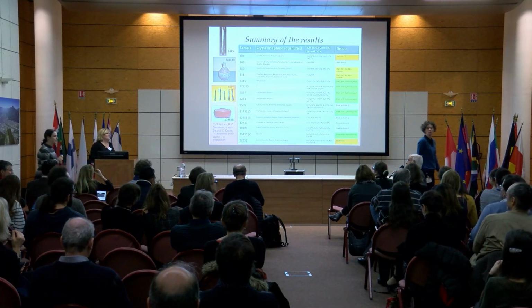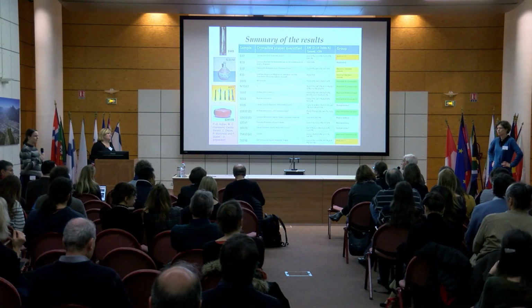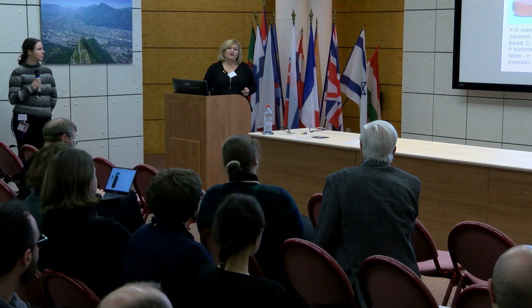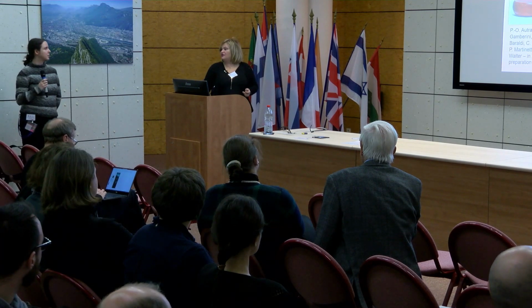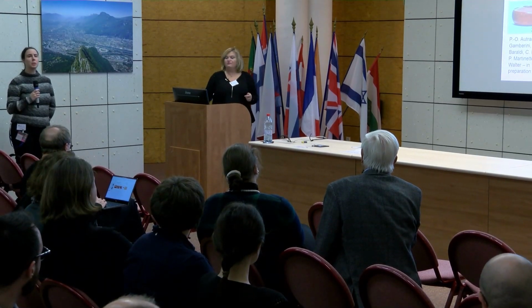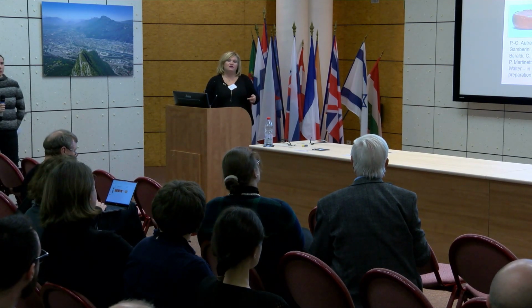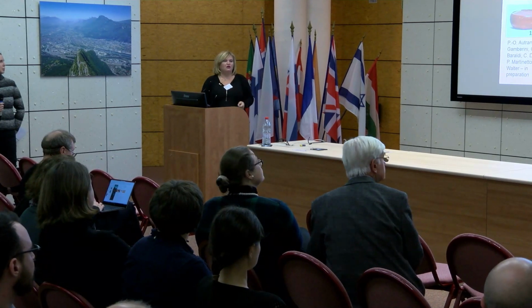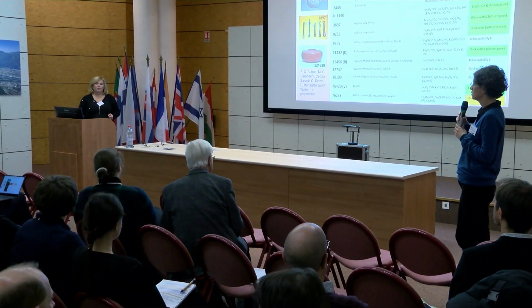Related to that point Vito made, just from curiosity, would you see in Raman spectroscopy galena, the lead sulfide? Well, sulfur of mercury. Lead, yeah, no. I don't know the name. Mercury, PbS. And also Pb carbonate, basic carbonate. The question was if you have detected lead sulfide. No, galena, lead sulfide, no. No. Okay.